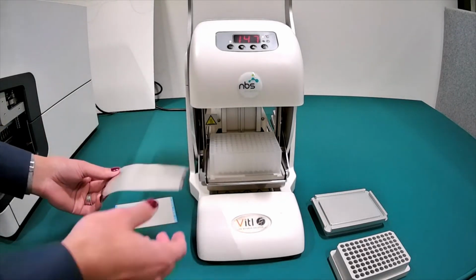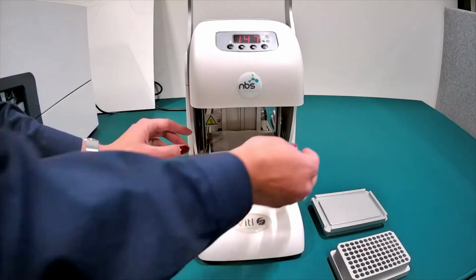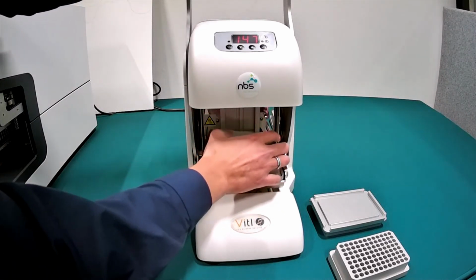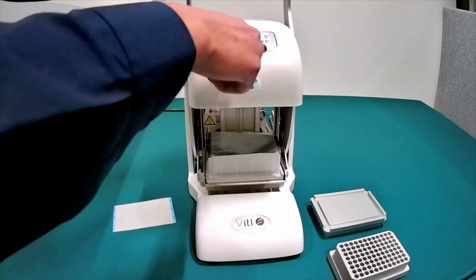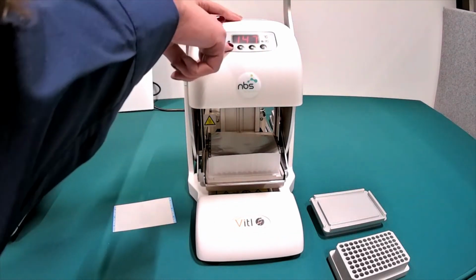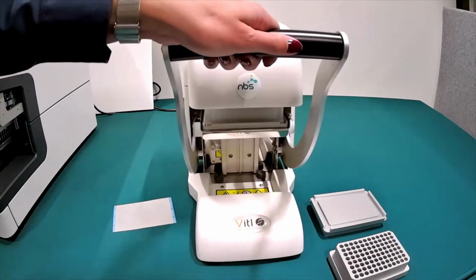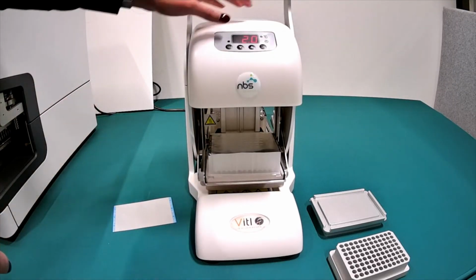So if you put on your seal, you press it down, and yeah, I can show you. It's like this. Of course, I just took one seal, so it's not the perfect seal for this plate, but I will just show you how it works, and then you can also hear the beep. So I put in the temperature, I put in the time, I will put in 2 seconds. And then you press it down. So that's how it works.